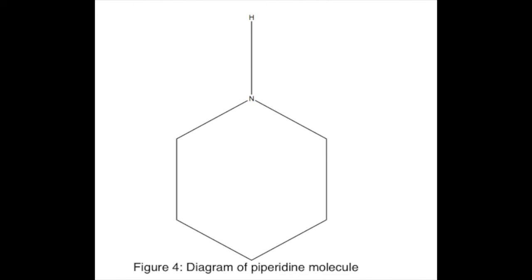Figure 4 shows a diagram of this molecule. According to PubMed, piperidine is a widely used secondary amine that is oftentimes the building block of pharmaceuticals. It gets its name from the Latin genus name piper, which is the word for pepper. This was named accordingly from the ammoniacal scent which can come off as peppery. Throughout the analysis of the single unknown compound, the objectives of this experiment were met.